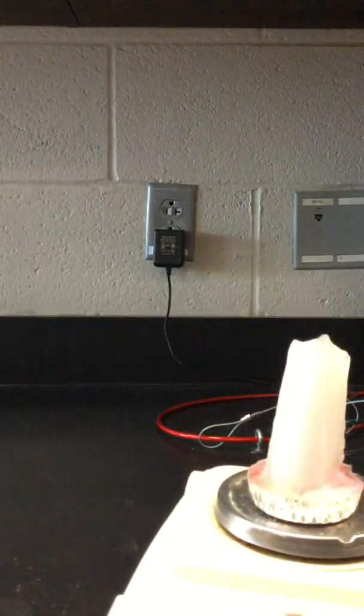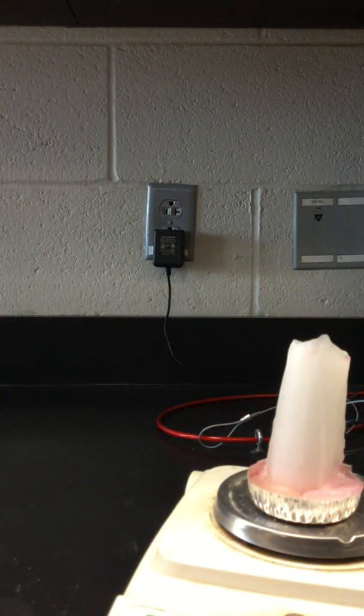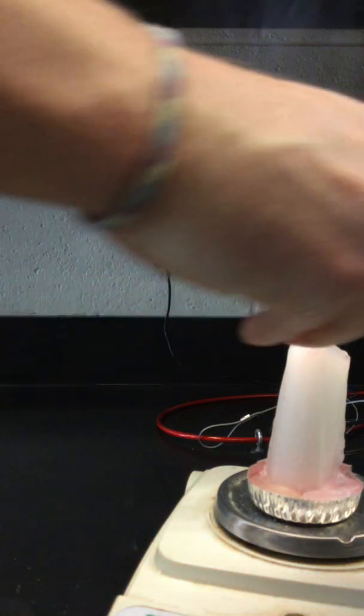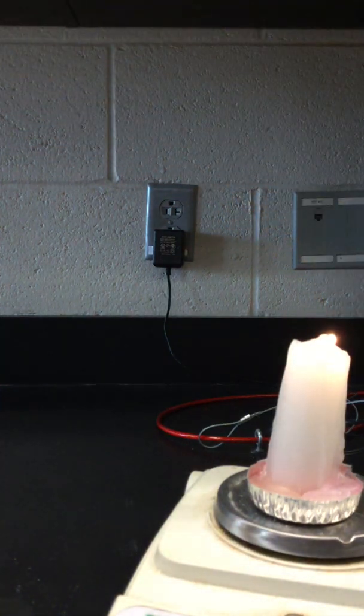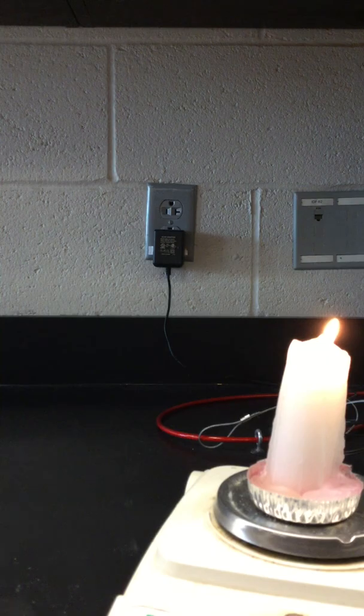So I'll let you guys sit tight for a second. We are going to light a match. I'm going to let this burn for a little while, and we're going to come back to it. All right, so my candle is lit. Let's come back and see what that mass looks like a little bit later on. While we wait for station 9 to burn, we're going to move on to station 10.